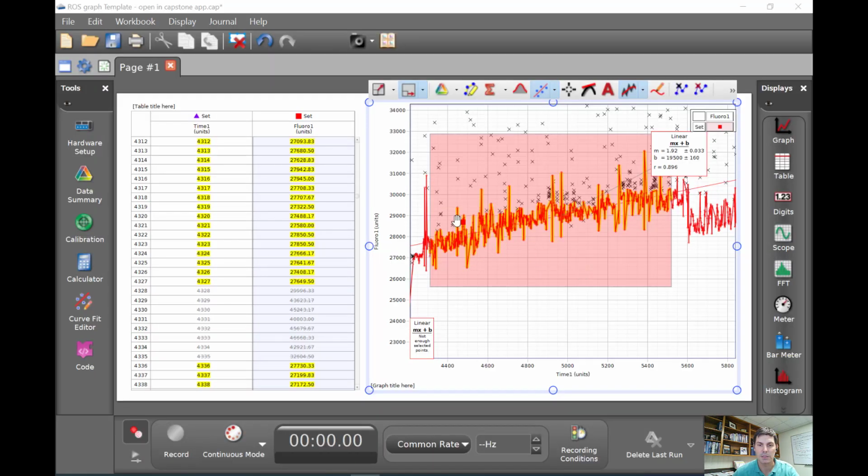Okay, so I've tried to clean this as much as I can, but I would encourage you to chop out as many of those points on the high end, and maybe a couple on the low end, to be a little bit better. Nonetheless, this gives us a really good demonstration of what we ultimately want our data to look like. I want you to take a look and make sure that this red line, the line that our slope is running behind there, visually matches the data points. Look at this and say, if I drew a red line, how would I draw it? If it's similar, then you would continue.